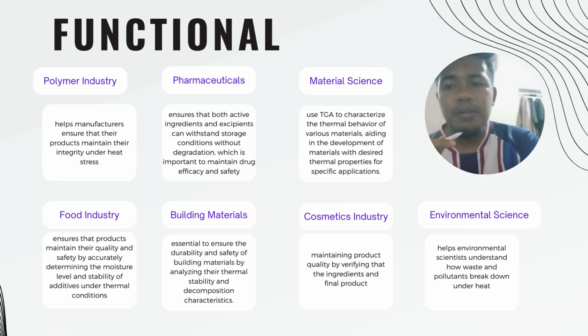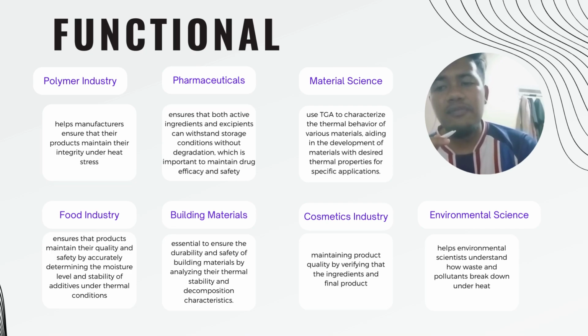For environmental science, TGA helps environmental scientists understand how waste and pollutants break down under heat, which is important for creating effective recycling and disposal methods. Next is the food industry. In the food industry, TGA ensures that products maintain their quality and safety by accurately determining the moisture level and stability of additives under thermal conditions.